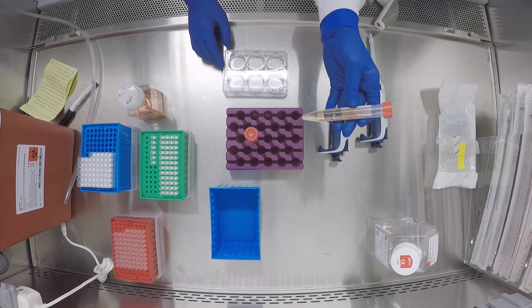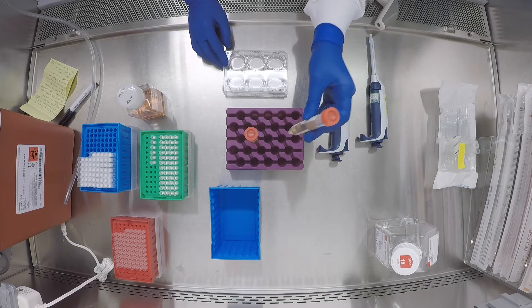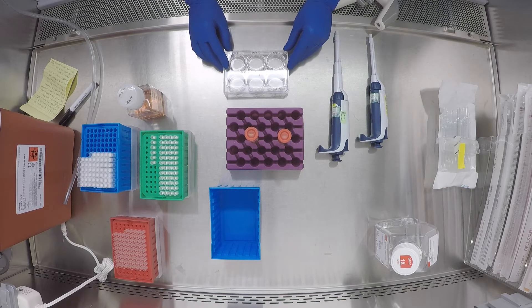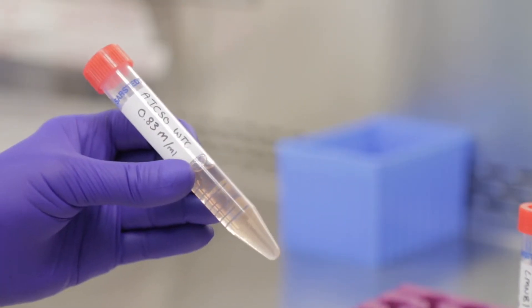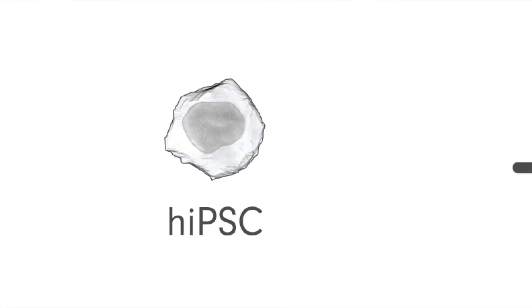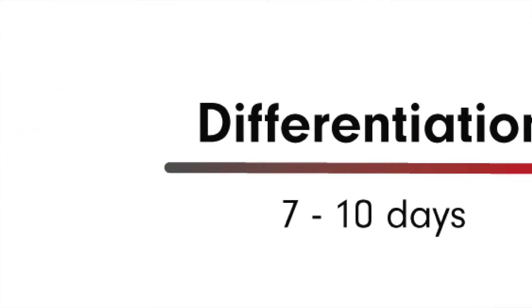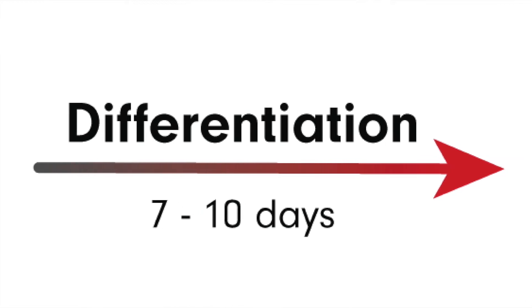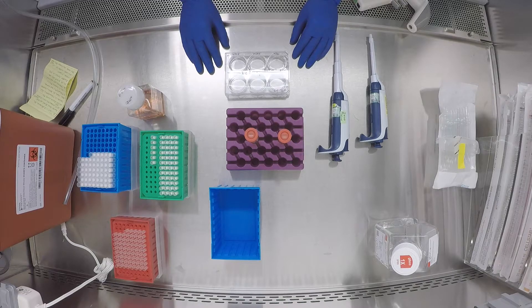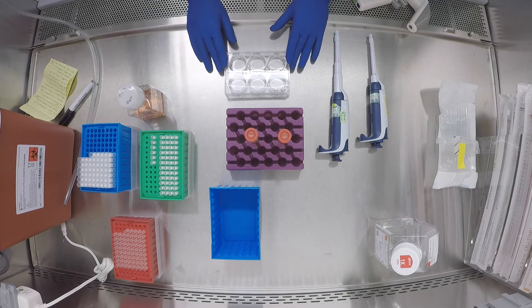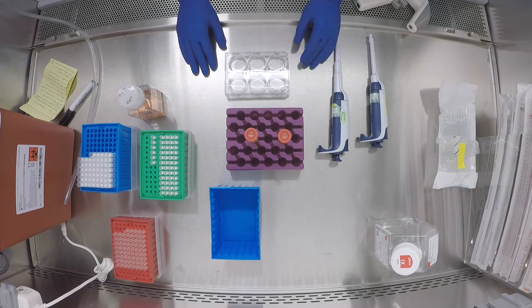We'll be starting with the cells already in a single cell suspension. I've already counted the cells and they're at a known concentration. I've also already plated the cells in 10 centimeter plates for undifferentiated growth to maintain the cell line. This differentiation protocol has been optimized for the WTC cell line and has also been tested across many of the edited lines in the Allen Cell collection. We are using a small molecule protocol and we're going to be plating the cells for differentiation in a six-well format.